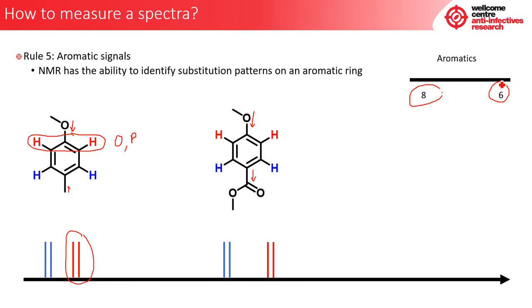And you can actually see this by the spectra here, that the gap between these two has become quite large, signifying to the reader, the viewer of this, that they're looking at two different environments, two very different environments. One is pulling electrons severely and the other not so.